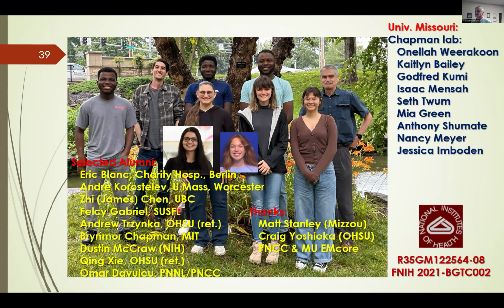We haven't experimented with the various enhanced forms. Particularly, we haven't looked at the machine learning enhanced forms. We do also look at the unsharpened map because sometimes there will be regions that clearly don't have the right sharpening factor that we can detect with the original map.